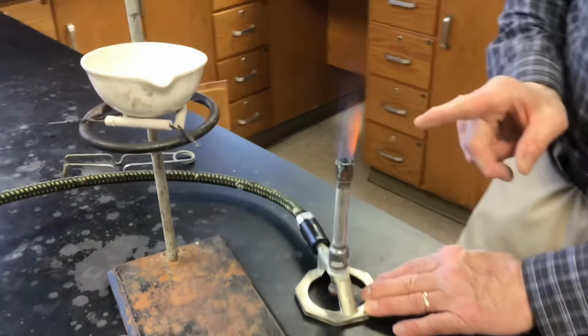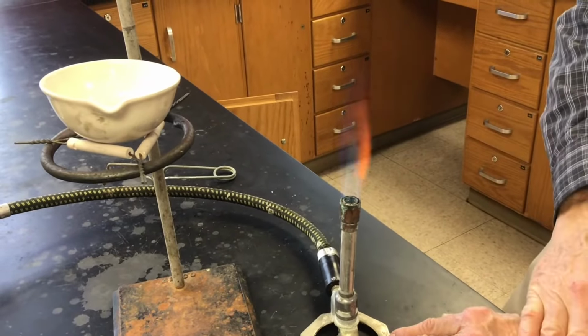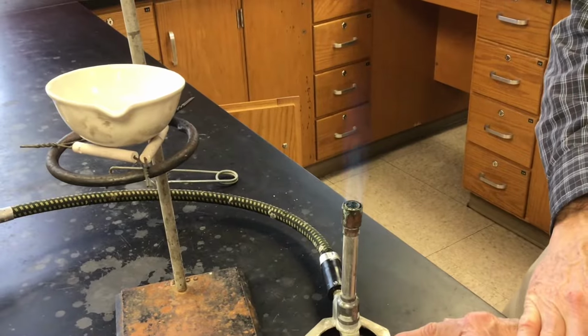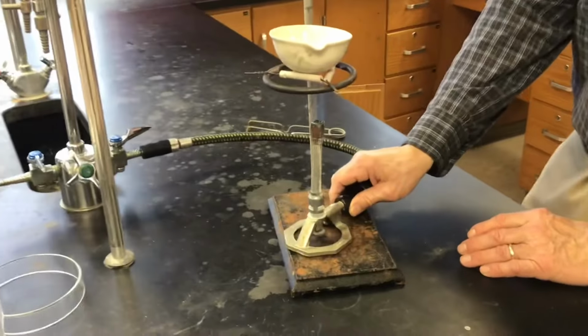We want to get the hottest possible flame, and the tip of that inner blue cone is the hottest part of the Bunsen burner flame. And so we're going to try to set that under the dish.